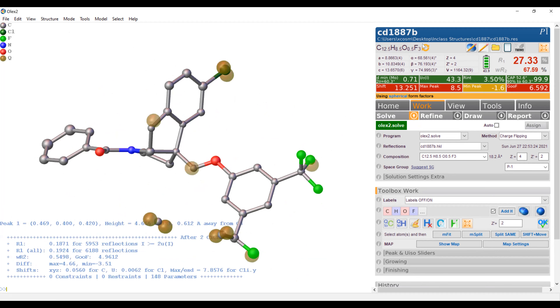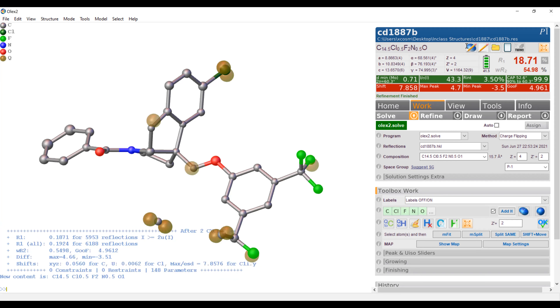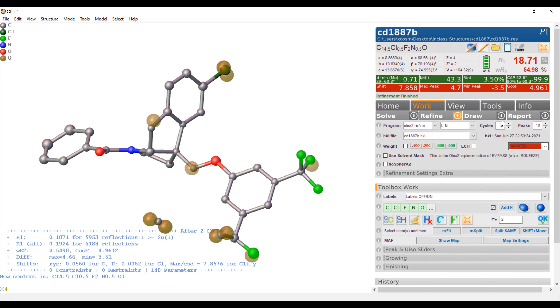Whenever you see these two orange arrows in a circle, this means you can update the chemical formula. Now we're going to go to refine. I'd like to go ahead and set the actor here and hit refine. Four or five cycles is good if you want it to converge on the first refinement.